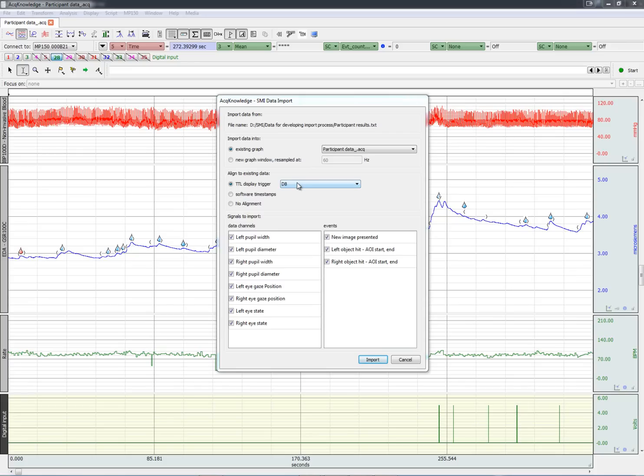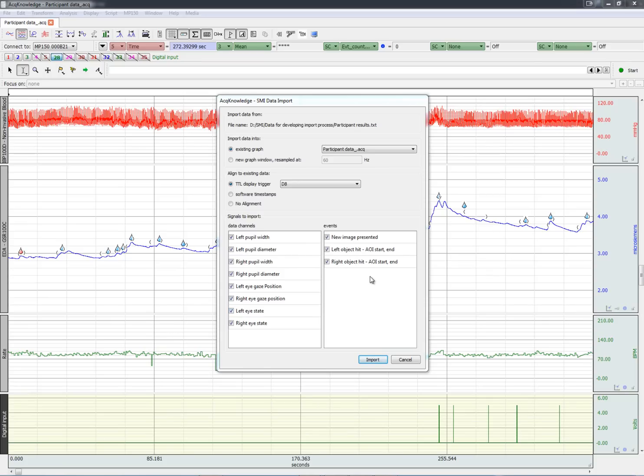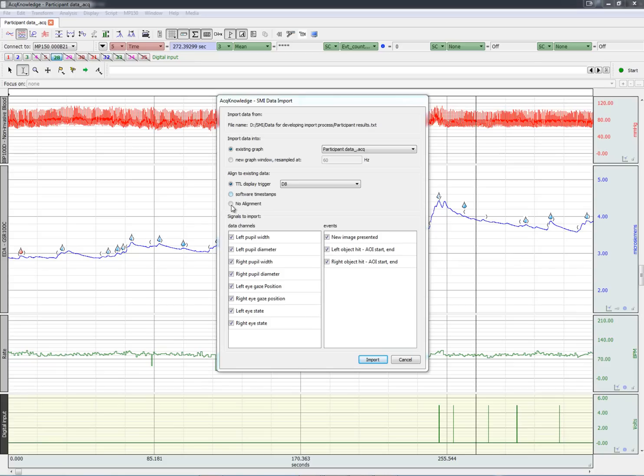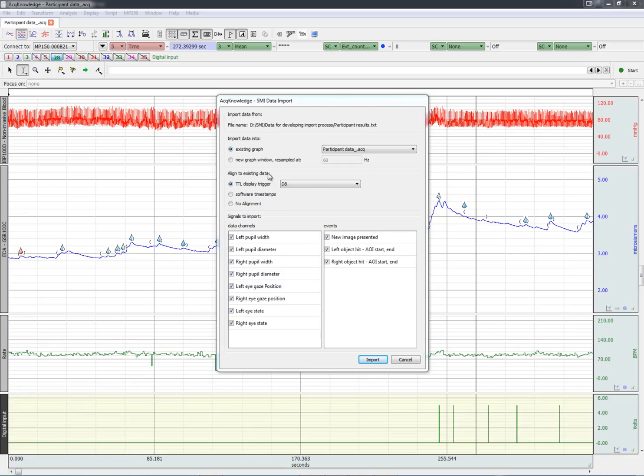We can also choose which signals and event markers to import. Note that we could also use software alignment or no alignment. But the highest accuracy, of course, is achieved via a TTL trigger marker. Let's import the data.